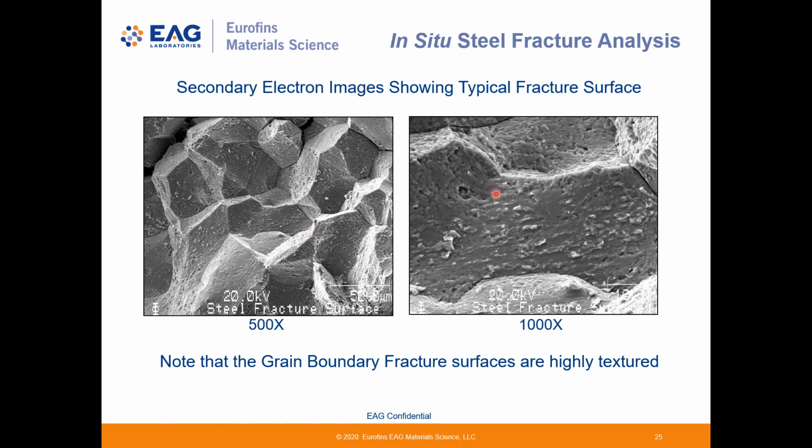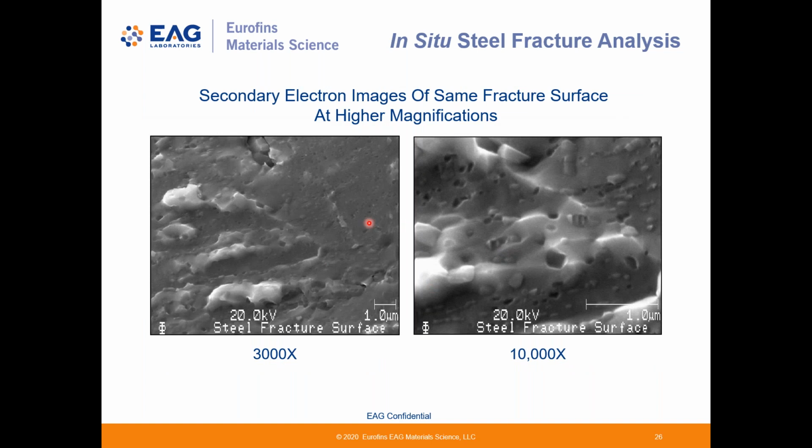We can zoom in and focus on an individual grain and note how highly textured the grain faces are. We can zoom in even further and take note of any features that we may want to analyze later, like precipitates or grain boundaries, that sort of thing.